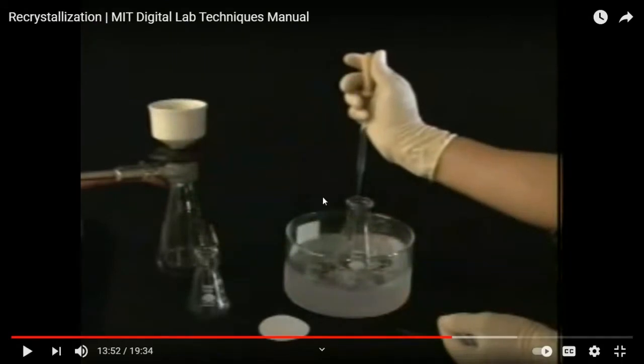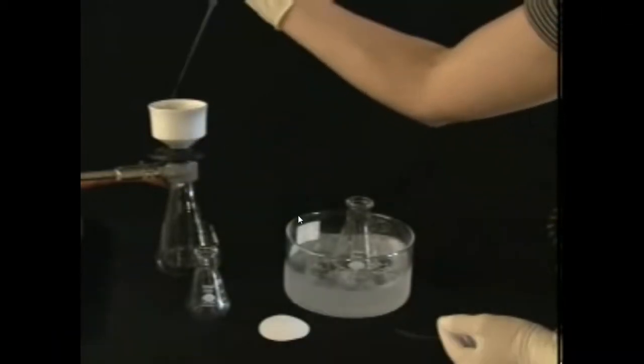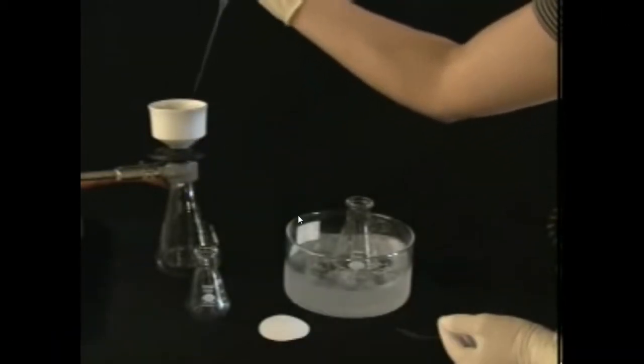Yeah, as you can see, she used small portions of cold liquid, not collecting them up, right? A little bit of it and pour out, a little bit of additional liquid and pour out, not many squirts at the same time. That's the exact thing I just explained. Use cold solvent to wash the crystals and pull air through them to begin the drying process.